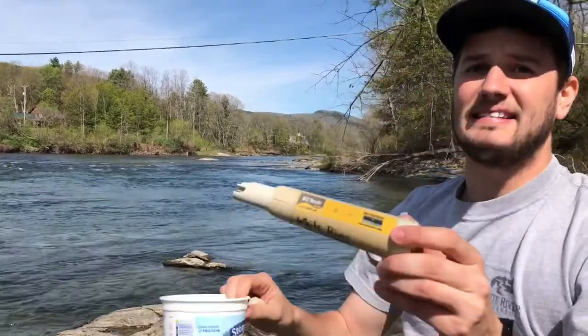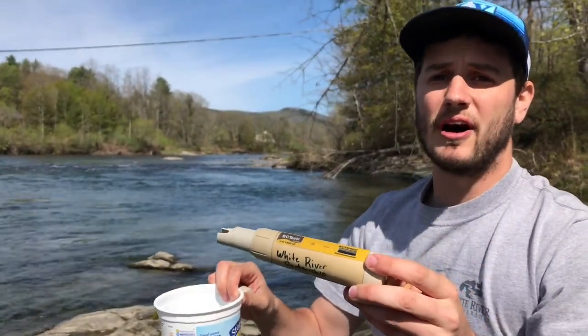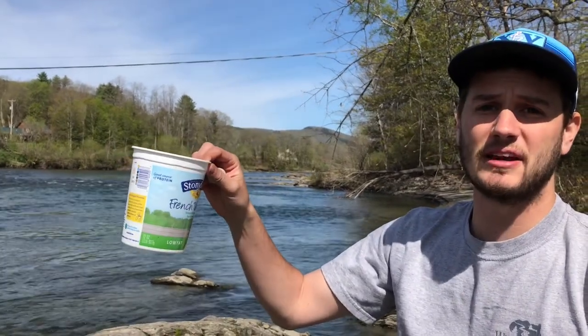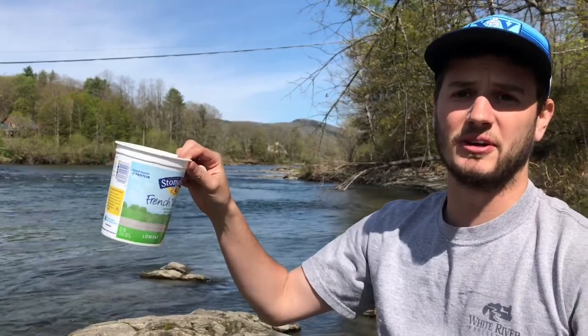If you have the EC tester pen you can do it two ways. You can enter the water and in the same location where you took your E. coli test you can place the pen in the water and wait for the reading to stabilize. This can take a while sometimes, so I find it best to bring a yogurt container, fill it with water, then bring it to shore and do your reading on shore. I'm going to show you that now.